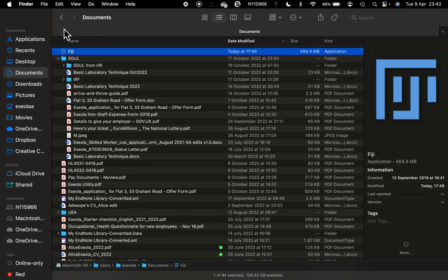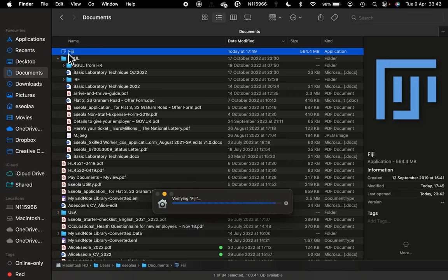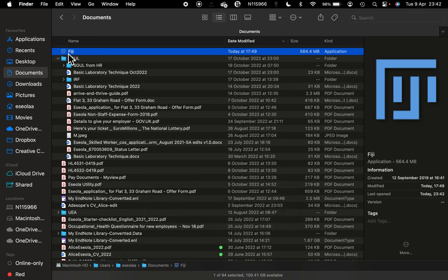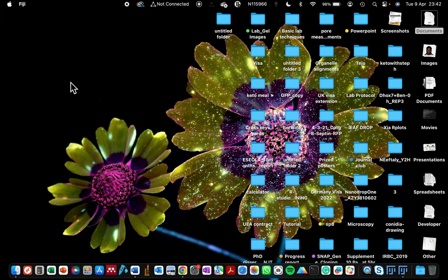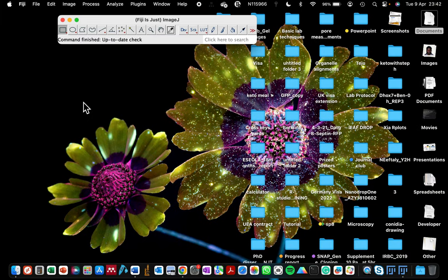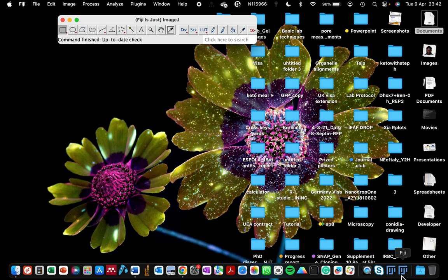If you don't want to have a duplicated Fiji on your computer, you can delete the one in the location that says application. That way you won't be having two Fiji as I'm having. I hope you can see the down part of my screen.